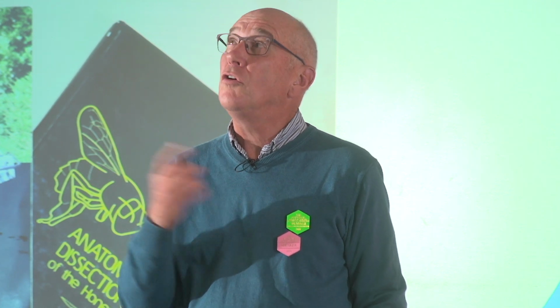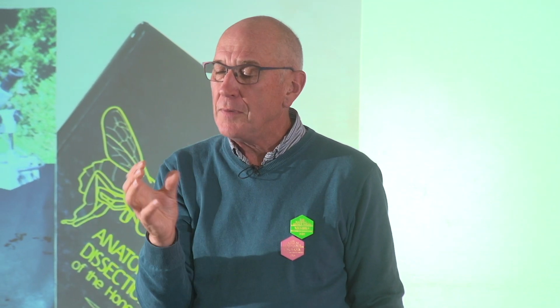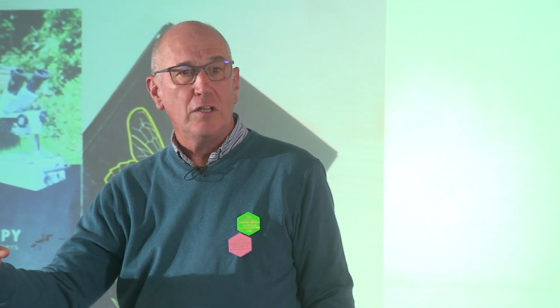Do you ever use bee bread from your hives and create a pollen slide with that? I personally haven't. Sorry, I have. Yes, I have, because it works just as well as taking the pollen load. You can go into your bee bread and just take it out, and you've just got to make sure that you've cleaned it. So we put it in the IPA for longer, and I would mix it into the IPA, decant it and put it into some other clean IPA, and then you can use it.